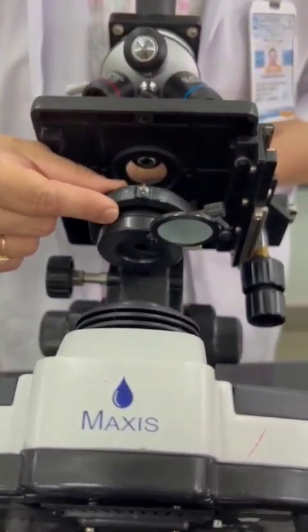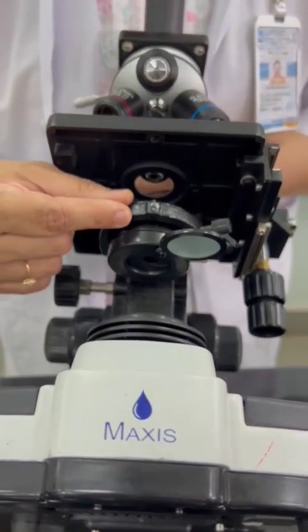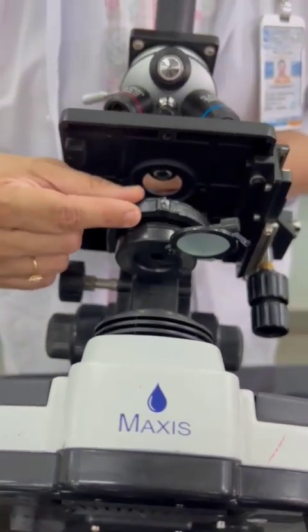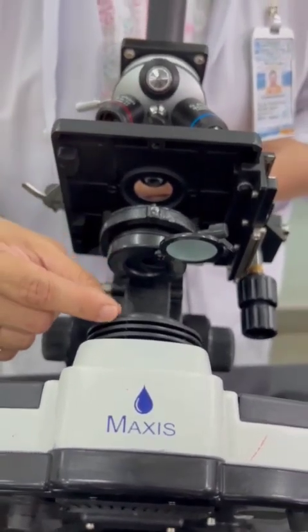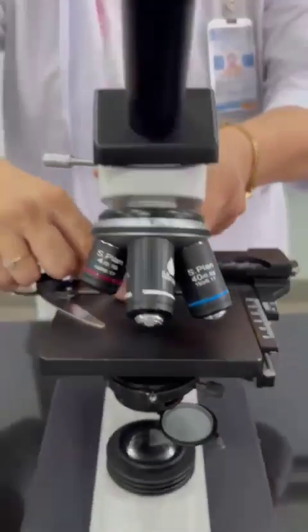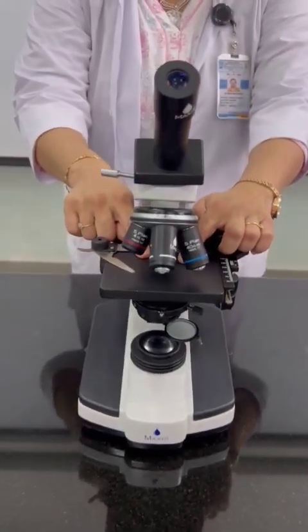This part is the condenser. The condenser is made up of many lenses and it is basically responsible for controlling or condensing the amount of light which comes from the source and falls through this aperture on our glass slide where the specimen is.